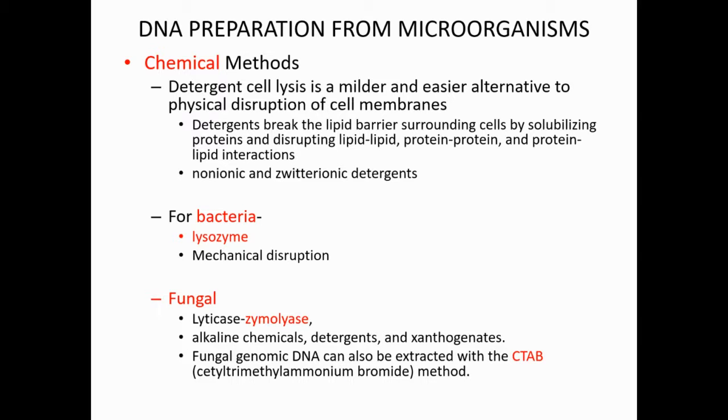The gram-negative bacteria are less susceptible to lysozyme, but the combination of lysozyme and EDTA can effectively break the cell wall and membrane. And the mechanical disruption method can be used to disrupt gram-positive bacterial cells and spores efficiently.